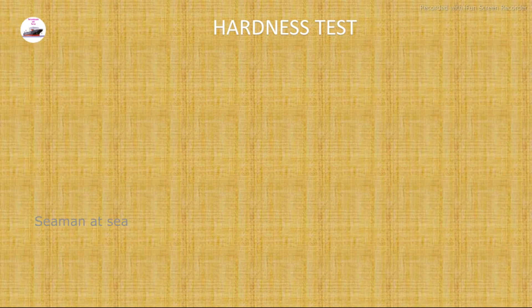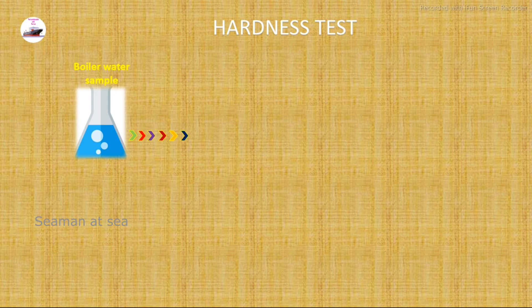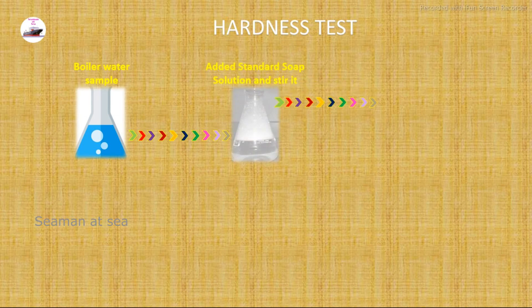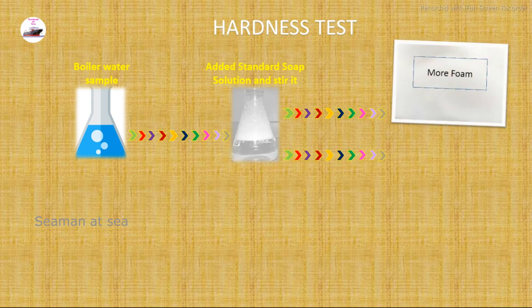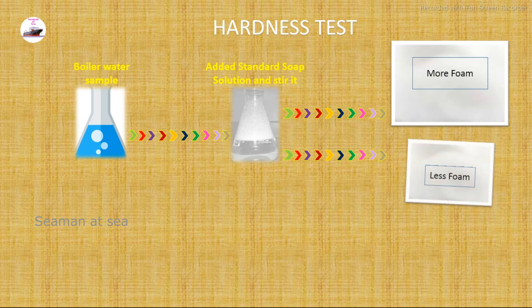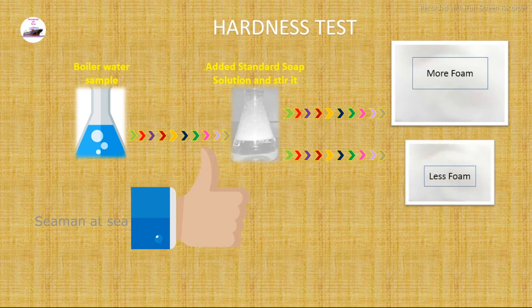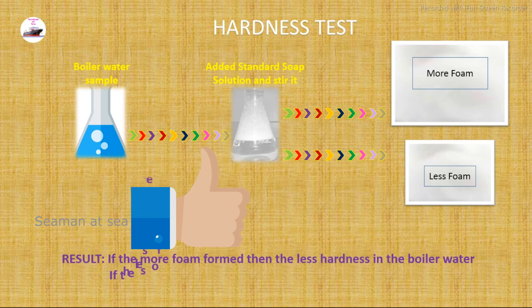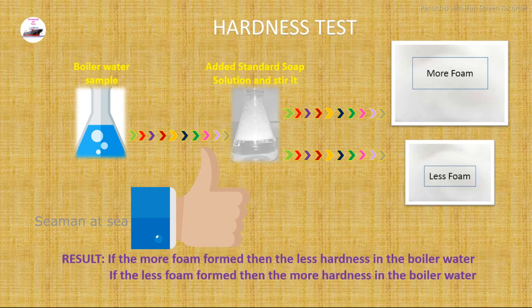For the hardness test, we take a boiler water sample in a beaker and add standard soap solution, then stir it properly. Foam will form — if more foam is formed, there is less hardness in the boiler water; if less foam is formed, there is more hardness present. This is how we find the hardness onboard ship. We have now seen all six testing procedures.